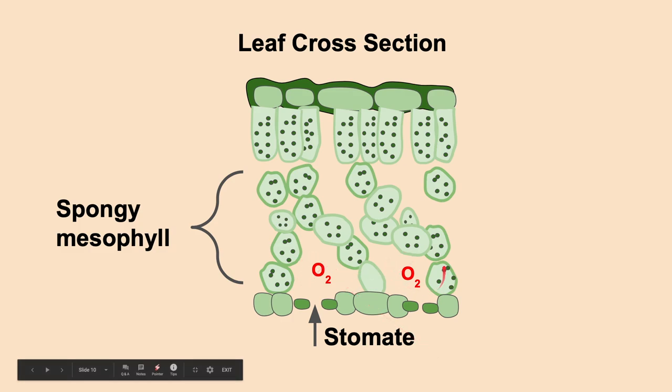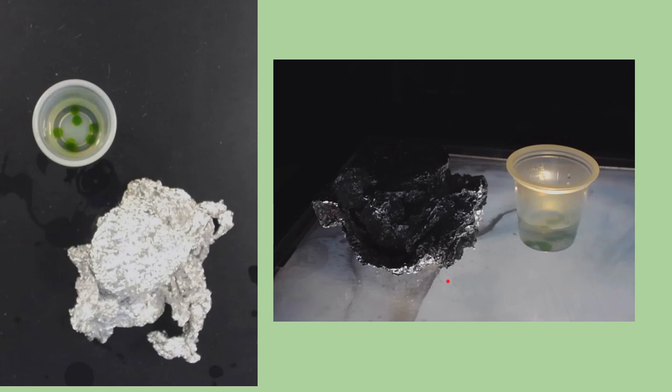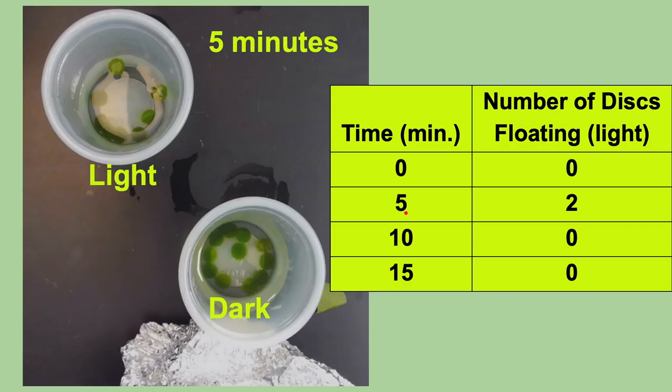By the way, to help trap the oxygen in here in our experiment, we're going to have just a little dab of soap to help trap the oxygen in. However, it will work without the soap, it just works better with the soap. So here's an example of a setup. Here's 10 leaf disks and two little cups. We have one covered in foil, one we're going to leave open in the air. It's a little dark because I have the lights shut off in the room, because I only want the plant cells to receive this light source that I'm giving it. So the idea is that in the tin foil, it's not receiving any light and we can wait some time.